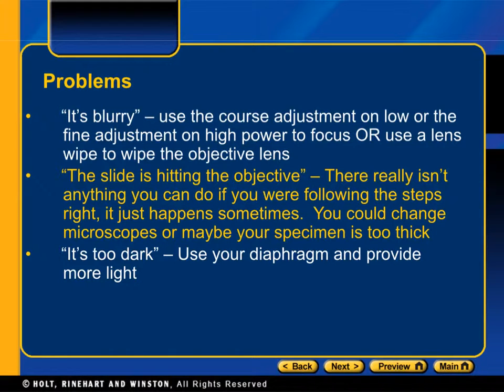And then a really big problem is it's too dark or it's too light. You can't see it very clearly, and that's when you have to use that diaphragm, because a diaphragm will make it darker or make it lighter, and it makes a huge difference.